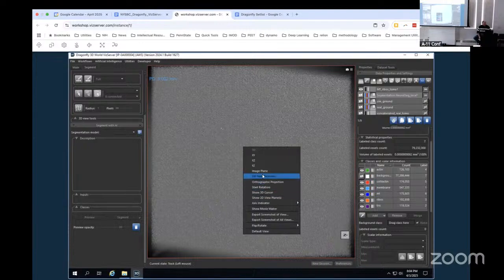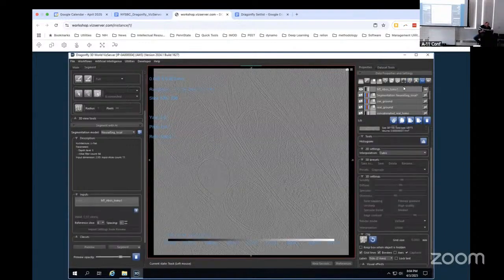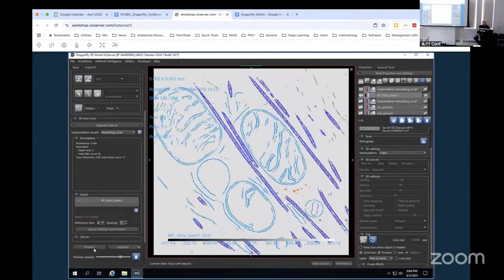Of course it's going to do all right here. That looks like a neuron. It's pretty high signal. There's no reason why it wouldn't do well. In fact, I'll just preview it so we don't have to see the whole thing. You can do that in 3 dimensions, and you can get yourself a segmentation.